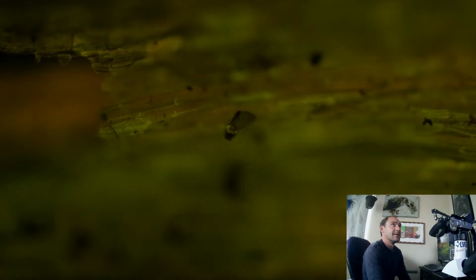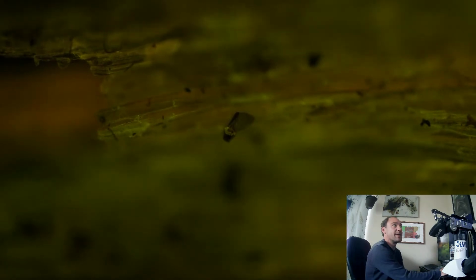Alright, next up is onion. This is actually going to be a pretty big root. Yeah, fills the whole screen. We might want to bump back out to stock, no digital zoom. Let's take a look at the onion root. Oh yeah. Holy cow. Let's actually see.